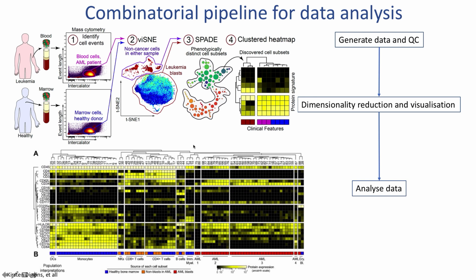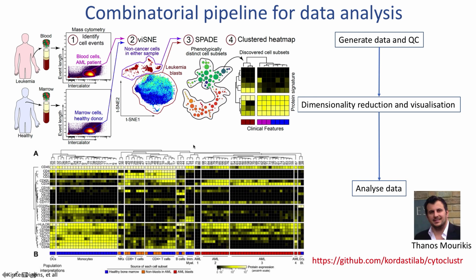And a very talented bioinformatician in my group, Thanos, developed a package, CytoCluster, that you can connect to Cytobank, download the data, and do the hierarchical clustering using this tool, which is freely available. There is also a webinar available through Cytobank, in which Thanos explained how this works and how we can use this tool for hierarchical clustering.